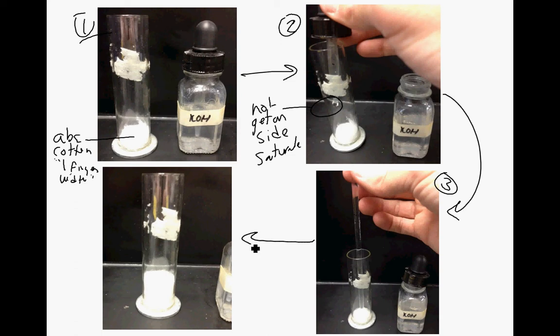And then step number four, you're going to put some non-absorbent cotton on the top. Non-absorbent cotton goes right on top there, and you can tamp that down a little bit as well if it's sticking way up. You want to have plenty of room in the chamber to put your organisms. So that's the first setup. You're going to do this three times. You need three of these respirometer chambers set up. So as soon as you get in, get your respirometer chambers and start getting them set up.